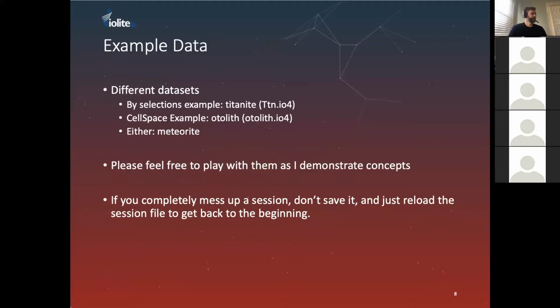questions and answers. So just in terms of the example data, unlike the previous webinars where we've gone through step by step how to put together a session, this time we've got some sessions pretty much ready to go, and you're free to just play with them.